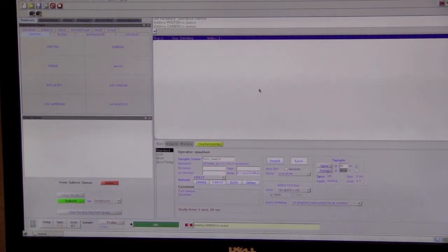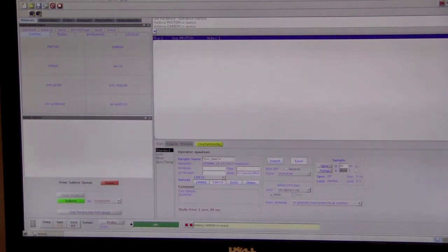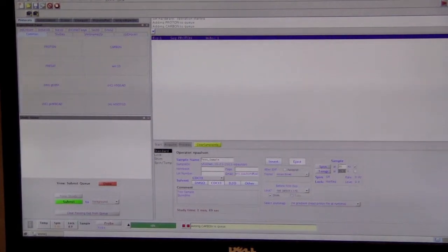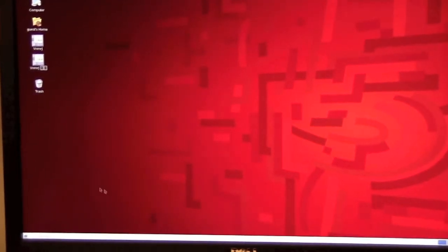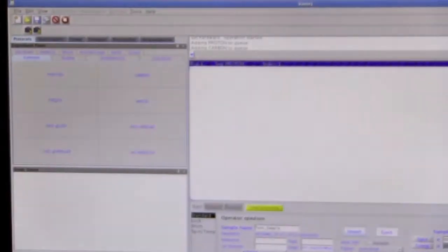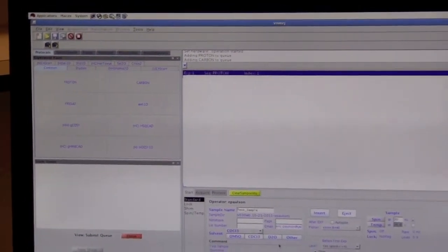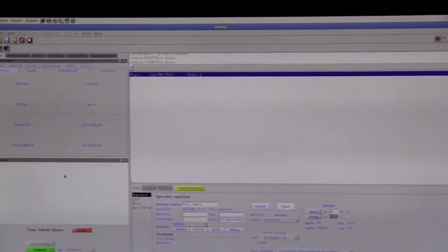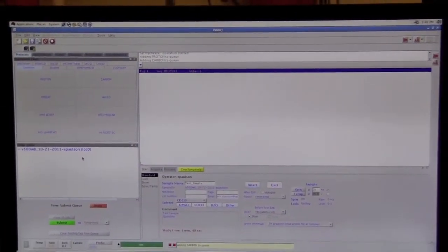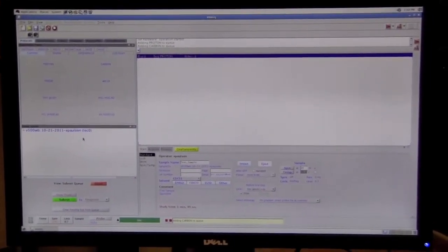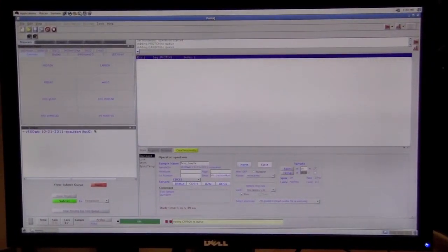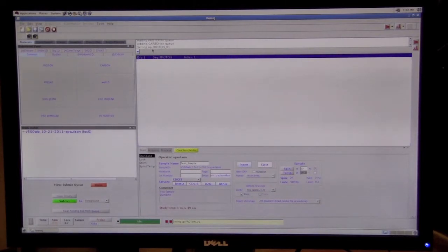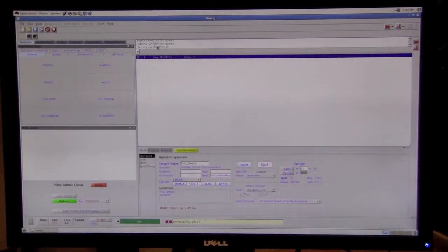If the program does crash, or if it's really not doing anything, probably your best bet is to close the program. And then you can restart it here from VNMRJ. So hopefully, in this case, it will eventually come up. I think it's going here. So, it's finally responded here.